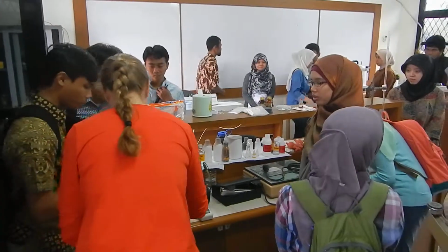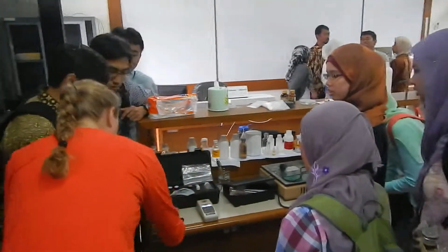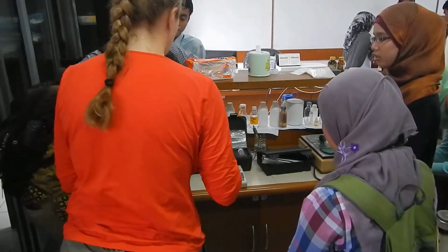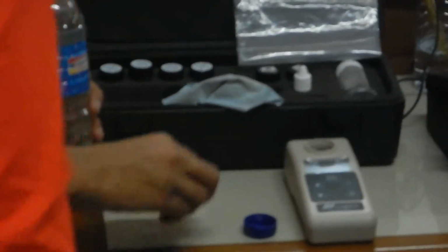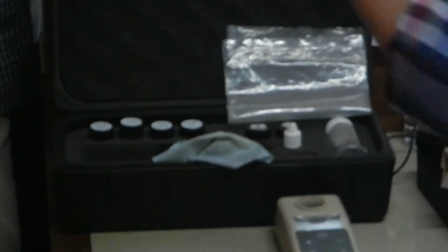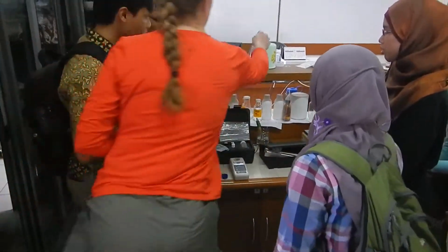So here's your vial. So you shaking it up, you just want to carefully pour in until you're a little bit above the white line. We'll screw the cap on, and then we'll wipe the outside. Afterwards, because you're probably going to pick the vial up. You can pick it up. There you go.